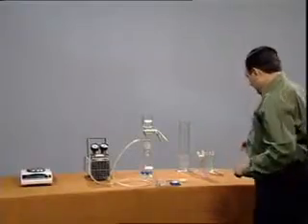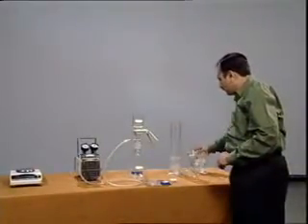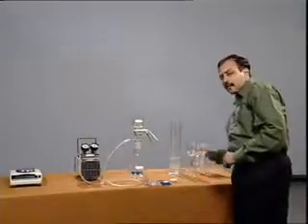So, we measure 1 liter of the sample. Now, here we are using a groundwater sample.